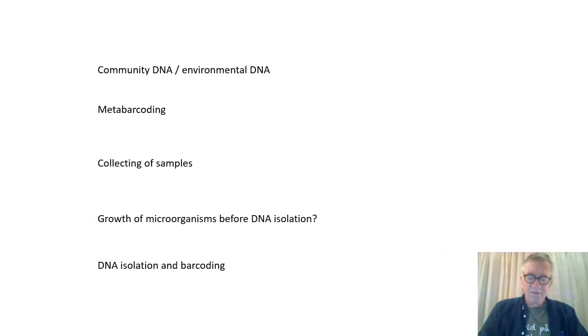Right. First, some bullet points connected to the exercise we are going to do today. We have this word community DNA, or environmental DNA, or eDNA. Well, they're quite similar words and also quite similar meaning, but there are small differences.